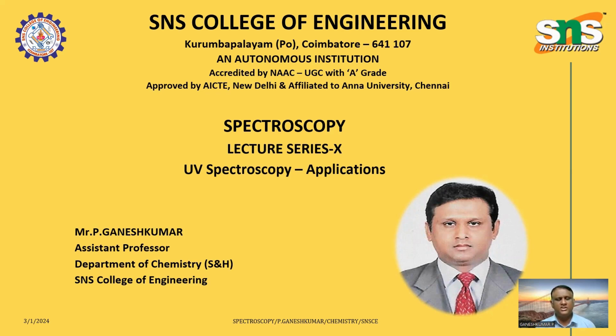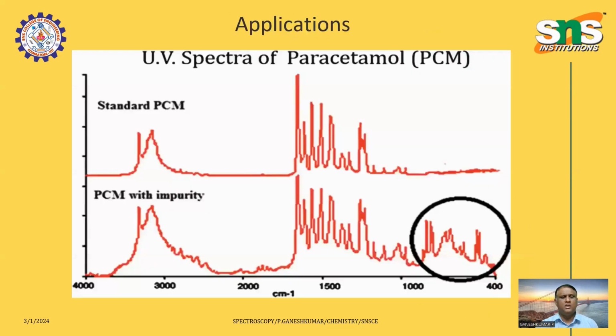And we discussed instrumentation: light source, monochromators, dispersing materials, and cuvettes, that is, sample containers, detectors, amplifiers, recorders, etc. Now, in the application part, just observe these two spectra. The top one is a standard PCM, that is paracetamol, and the bottom one is paracetamol with impurity.